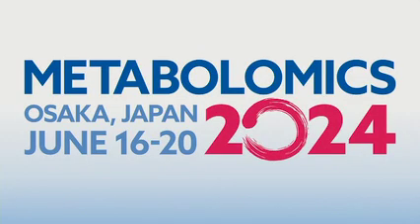Okay. And when I do a normal data set, will it give me a score? Will it do the same quality check in, say, a DDA experiment? Yeah, in some ways we also do this. For example, there's an intra-feature MS/MS similarity that we calculate. If you have multiple samples and MS2 spectra in different samples, we compare them and give you the maximum and median MS2 similarity between the features.